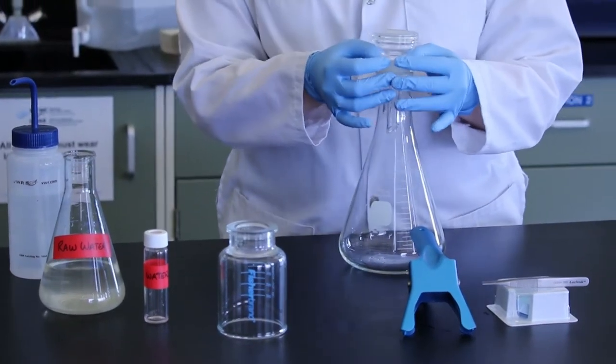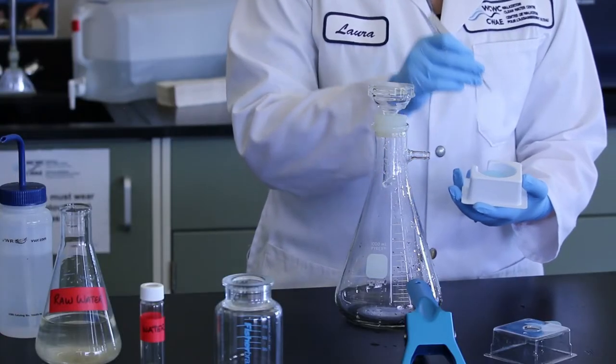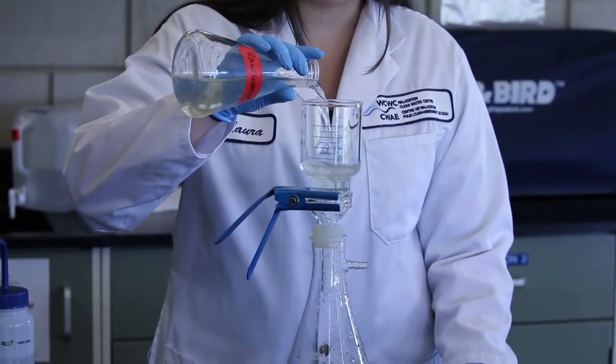A grab sample is collected and filtered using a 0.45 micron filter paper. This is to remove the particulate organic carbon from the dissolved portion.